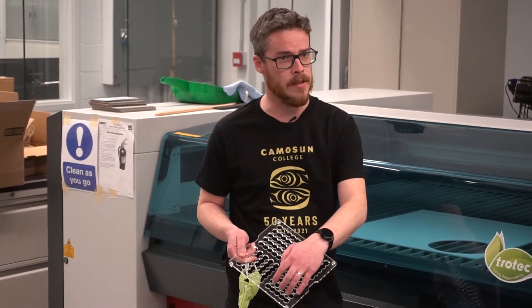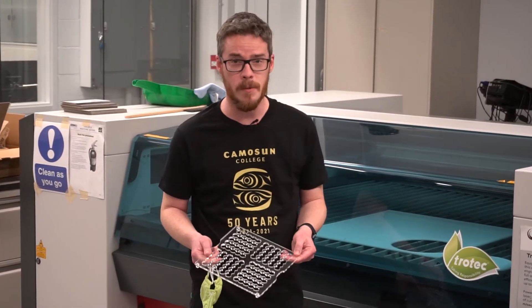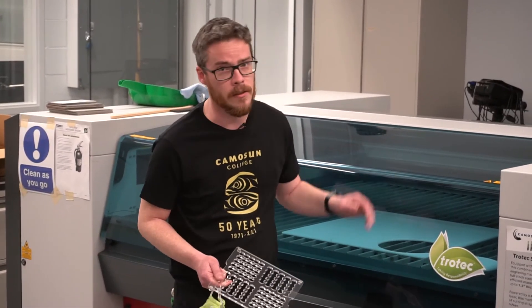Our initial prototype held 143 vials. We reduced it to 100 because that's closer to the volumes that they might need to ship, and we've also divided it into rows of five to make them easier to count at a glance. We manufacture them right here on our laser cutter.